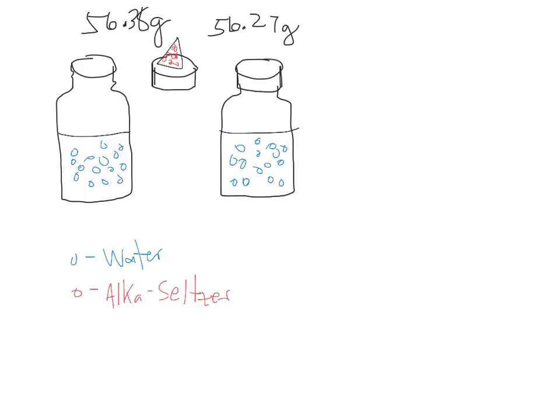All right. So, Alka-Seltzer and my water. Now, this is what you massed before: the tablet, the cap, the vial, the water. 56.38 grams. Afterward, you have less. Most people had about 1/10 of a gram less. Between 5/100ths and 1/10, almost everybody dropped. All but just a few.